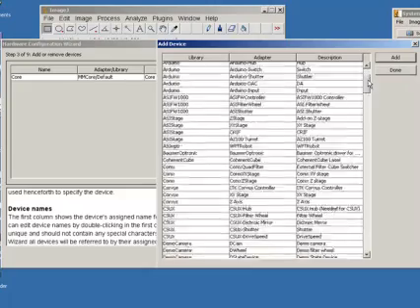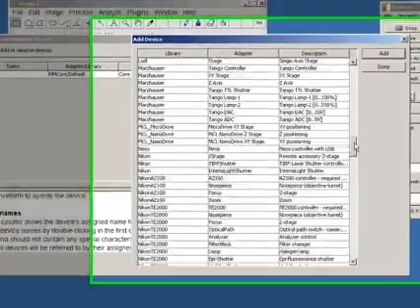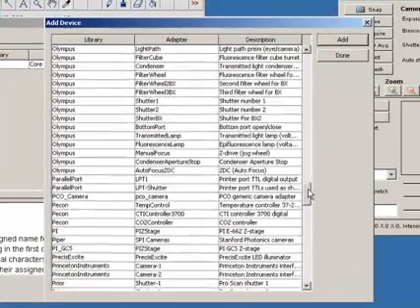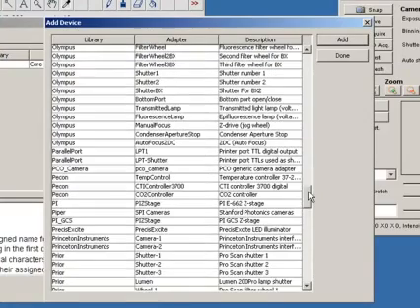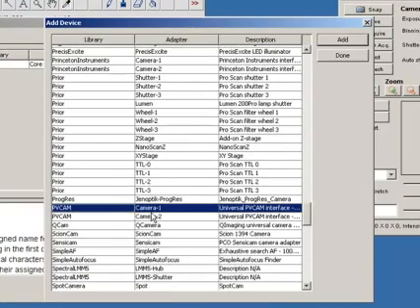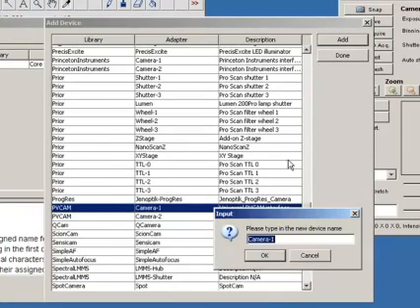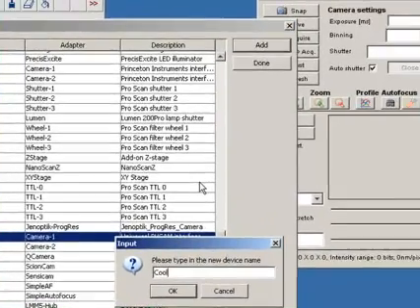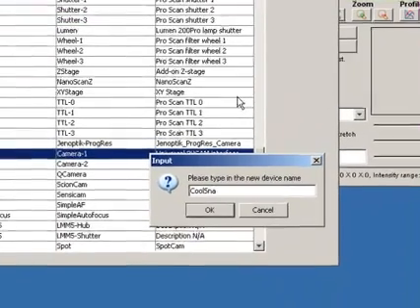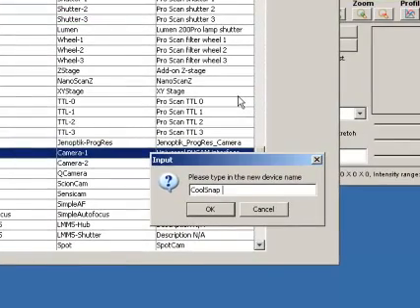So, as I said, we've got a Photometrix CoolSnap HQ2 camera. So, if we scroll down here, there will be some on the list, PVCam, which is our Photometrix driver. So, let's add that one in there and give it a name. Let's call it CoolSnap HQ2.